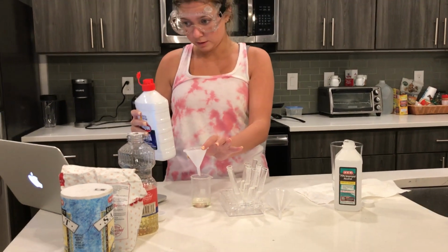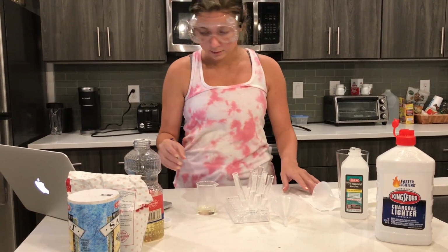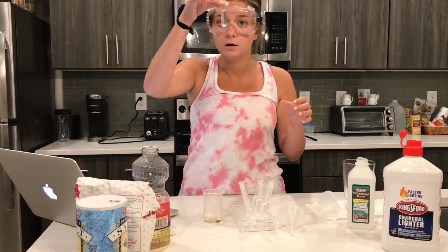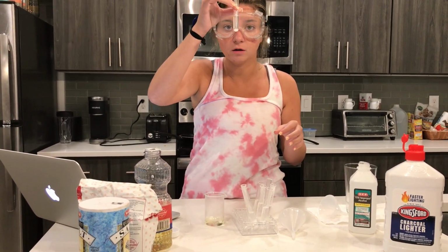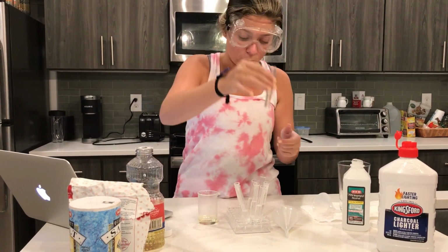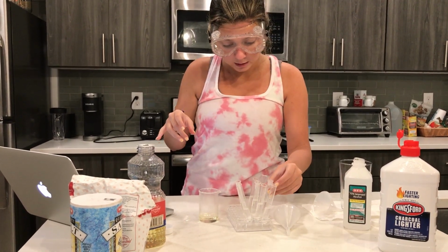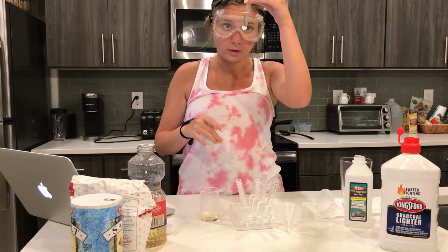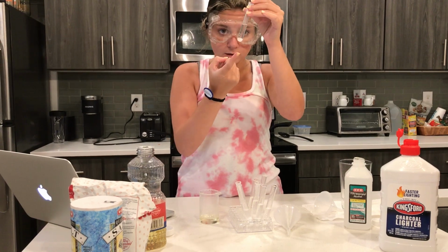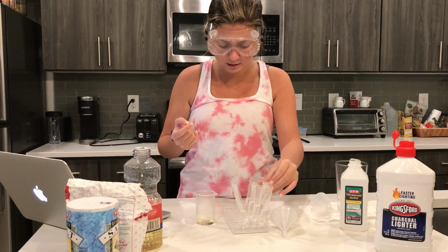Okay, so I have all of my solvents and solutes combined. So I'm just going to take a look at these and see if they mixed at all. The water and salt does not look like it mixed. There's clearly a line separating the salt from the water, which is interesting because they would normally mix. And then I have my sugar and water, and this one definitely looks like a little more faded into the water, but there's still clearly a chunk of sugar at the bottom. So I wouldn't say that that mixed.